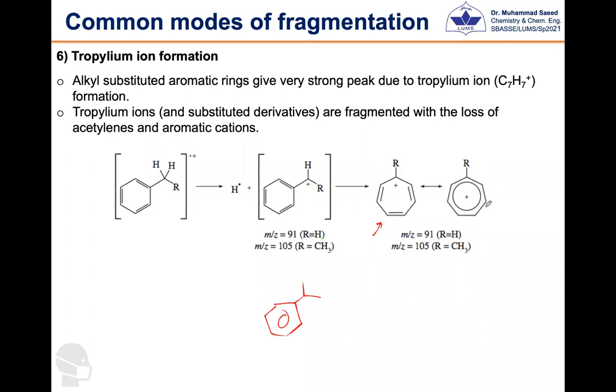So as soon as the tropylium ion is formed, it becomes stable, and most of the time they give rise to the base peak in such molecules.